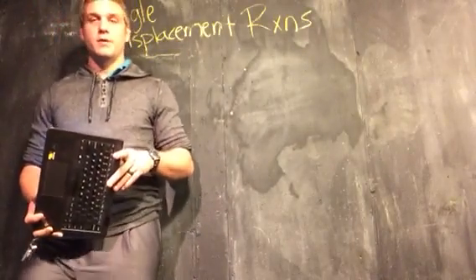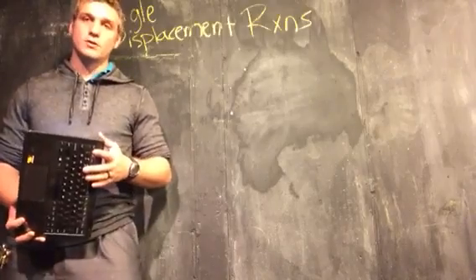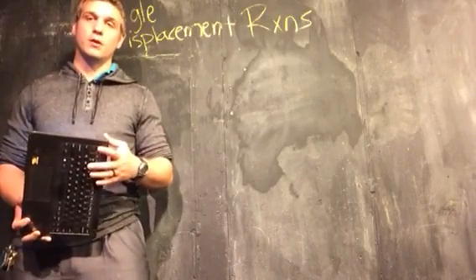Hey guys, this segment is titled Single Displacement Reactions. It's going to be the first of the 5 that we're going to look at.